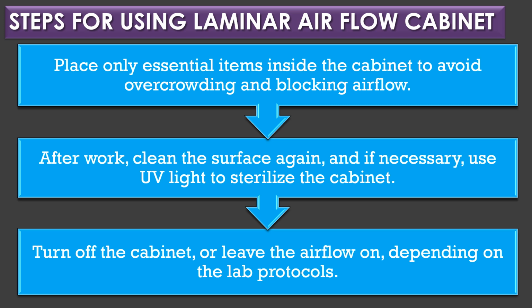In step 6, after work, clean the surface again and if necessary, use UV light to sterilize the cabinet. In step 7, turn off the cabinet or leave the airflow on depending on the lab protocols.